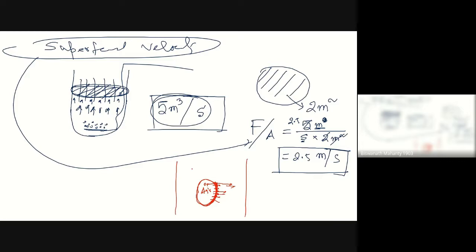If you are running it so fast and there is only this liquid layer, right? What will happen? Without dissolving, the air will come out. That is actually wastage of your aeration. So you should not have a very high airflow rate, and you should not have a very low one also. If you are allowing the bubble to rise so slowly that it takes some 5 minutes, then in a minute only one bubble will come up, right? That is not sufficient, even if it completely dissolves. So you should have an optimal aeration rate in your fermentation system.